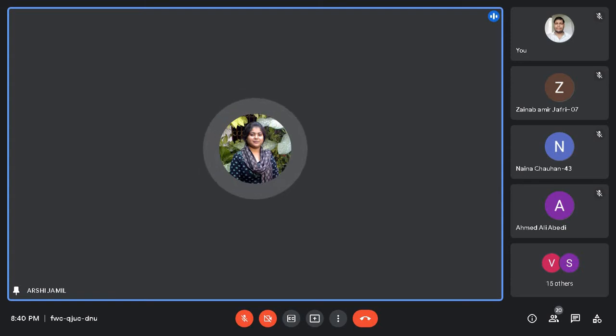So you take a seed from a particular lot and that is the primary sample. Field से आपने seeds collect किए, you bring the seeds to the laboratory और आपने उस lot के seeds को देखा, चेक किया, that is the primary sampling.